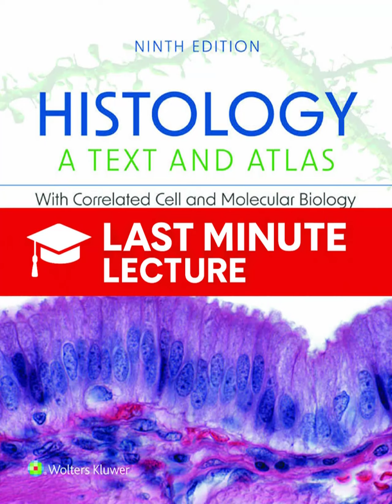But wait, we're not done. The tissue is still sitting in that colorless paraffin wax, and it's unstained. You can't see anything under a normal microscope yet. Correct. So before you can stain it, you have to dissolve that paraffin wax out again using xylol or toluol, and then you have to rehydrate the tissue by passing it back down through the alcohol solutions into water. And then we finally get to stain it with that famous H&E pair.